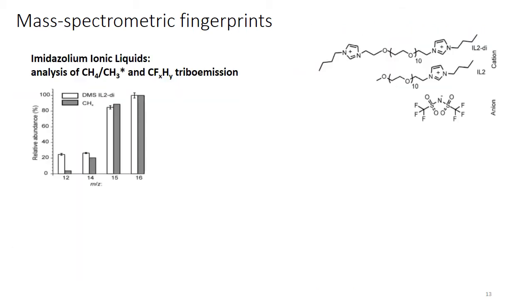Quite similar results were obtained in analyzing the mass spectra of various ionic liquids.